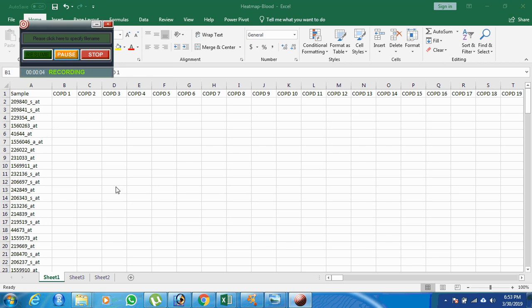We are going to check how we can prepare the heatmap especially for microarray data. There are a lot of freely available programs to generate heatmaps. The major problem with online resources is the limited number of rows and columns. The website I'm going to show you is highly useful because we can generate any number of rows and columns. Even using R programs is easier than this basic method.